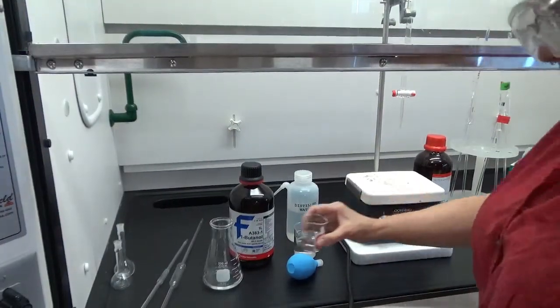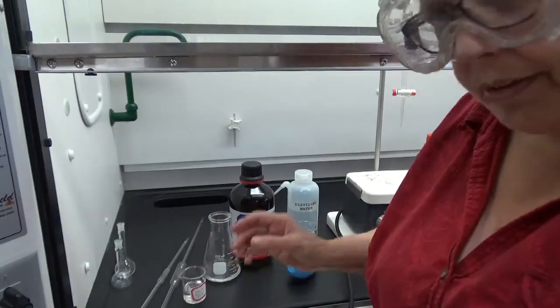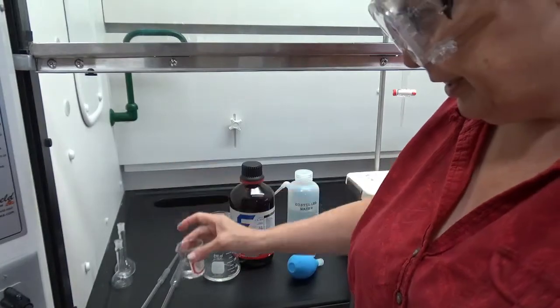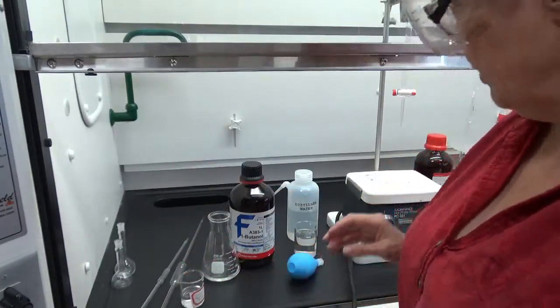So what I've just done is I've carefully poured some glacial acetic acid into this little beaker here, and now I'm going to fill the burette with it.